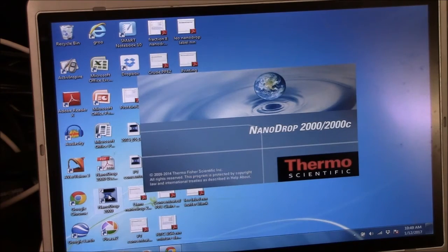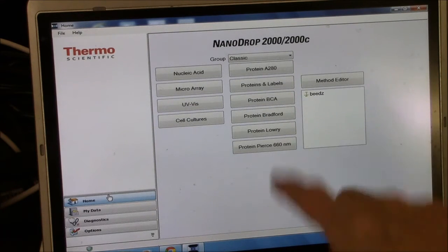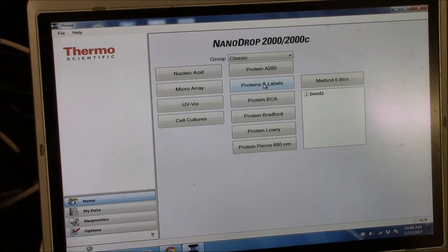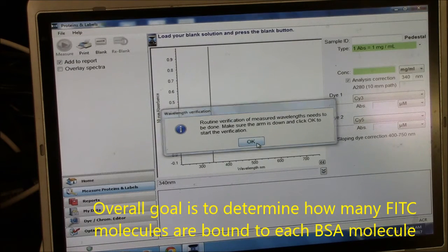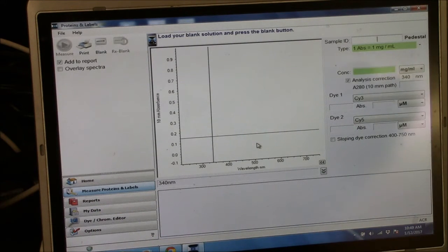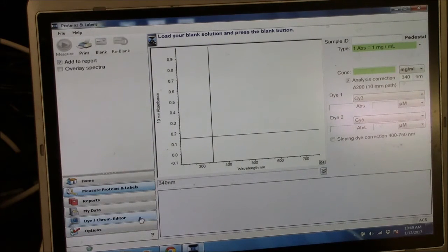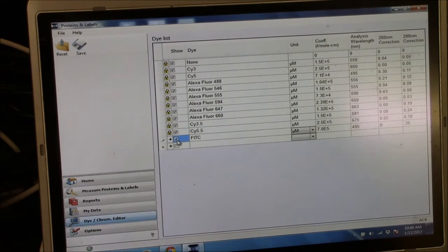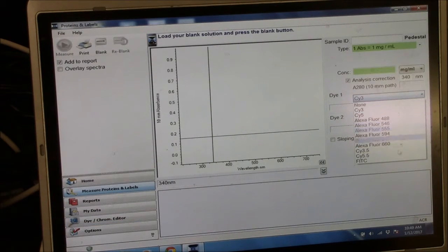Opening the NanoDrop software. The choice I want here is proteins and labels, which includes measurement of protein as well as some dye that is attached to the protein. This is routine. The dye I want to choose here will be FITC, Fluorescein Isothiocyanate. It's not currently listed so you'll have to go over here to the dye editor and choose FITC, click it and then that choice should be available here, FITC.